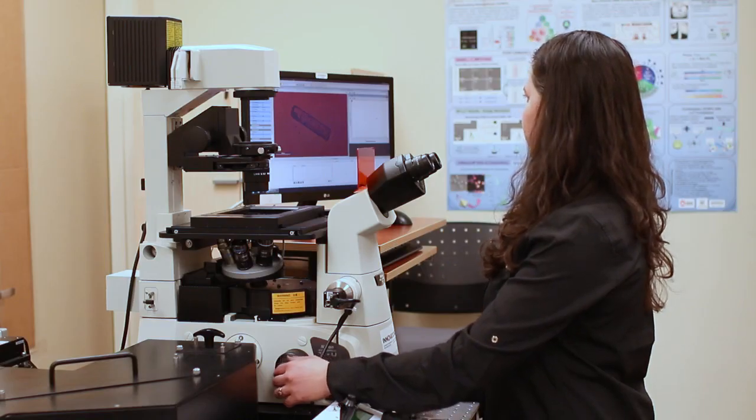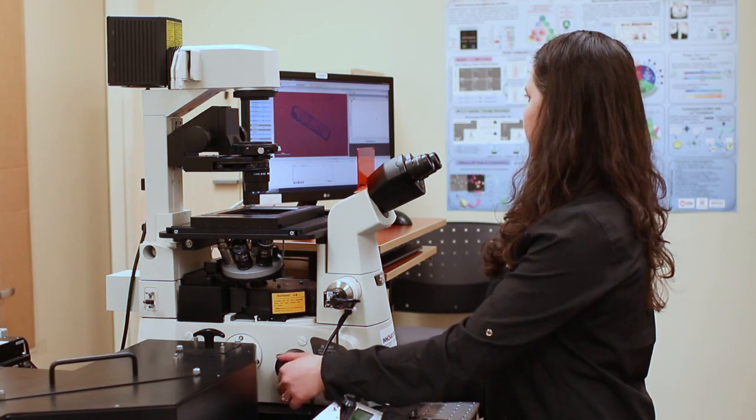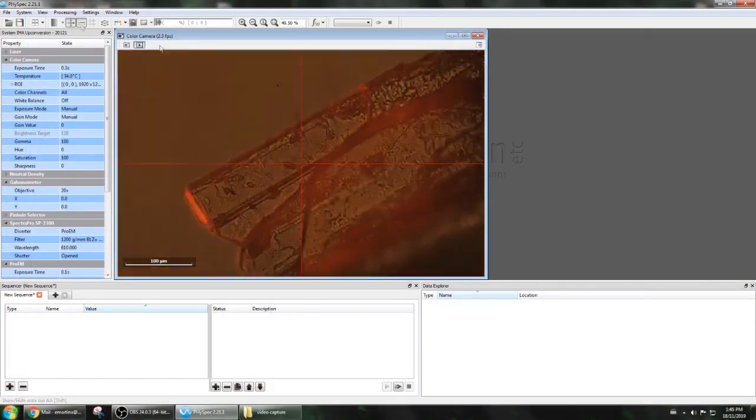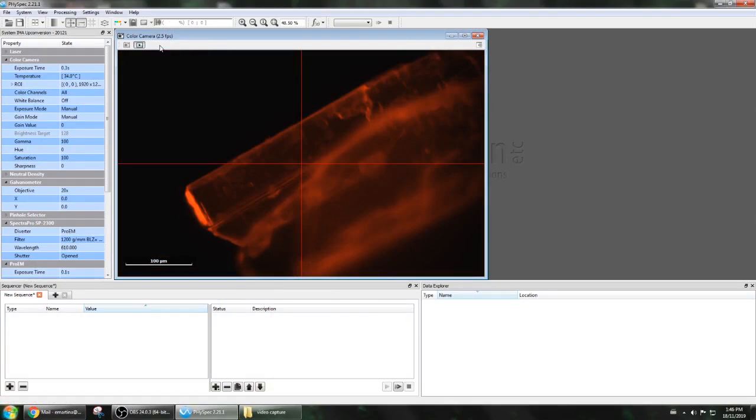This technique requires manual tuning of the imaging hardware as well as software manipulation. It is essential to illustrate both aspects visually to showcase how both methods complement each other.